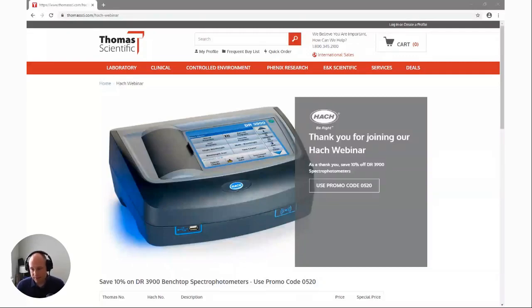For the reagents that are not chemically hazardous or toxic, that don't contain, for instance, mercury or chrome, those vials can be disposed of through your site's regular disposal system, however your lab or facility handles those.